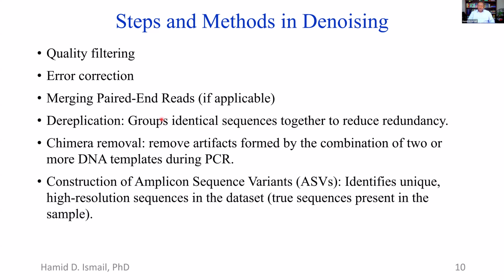And finally, we construct amplicon sequence variants, or ASVs, and this is the exact sequence that we will use. As I said, when you compare ASV to OTU, the ASV is more accurate. It's more accurate.